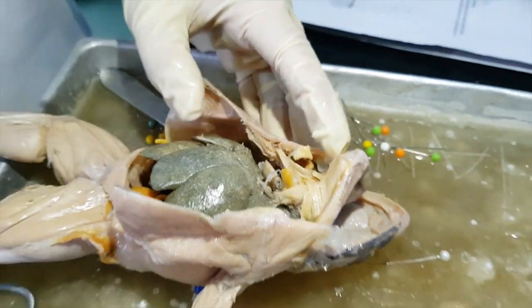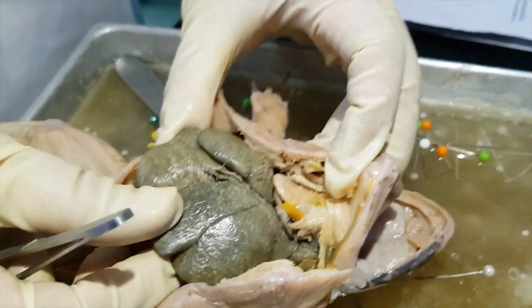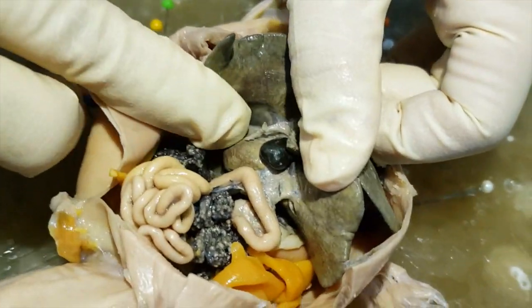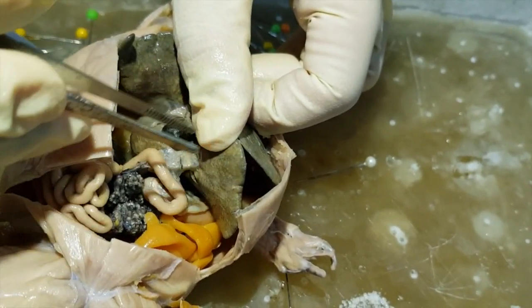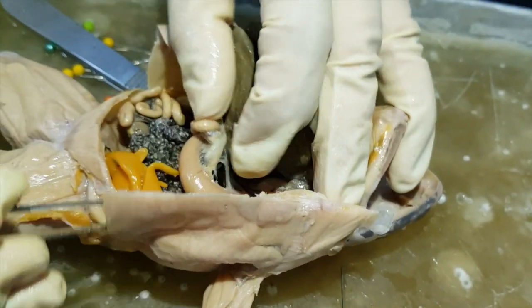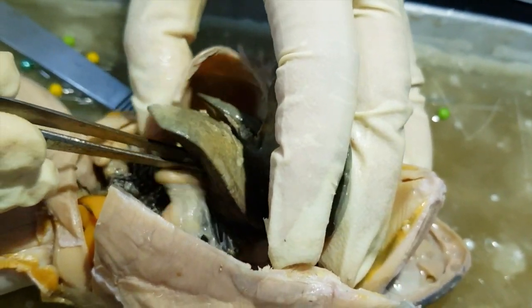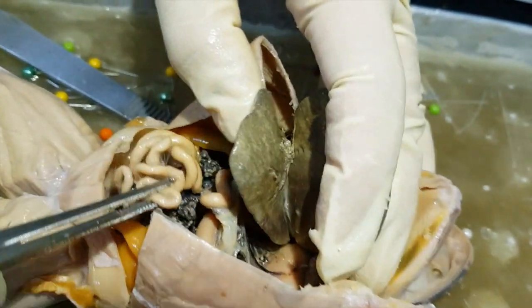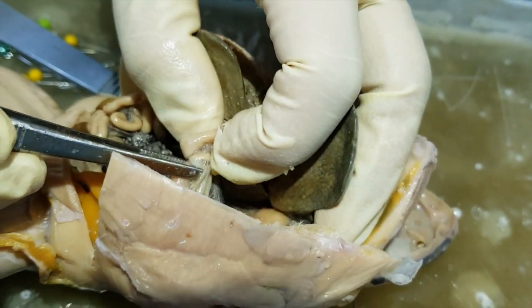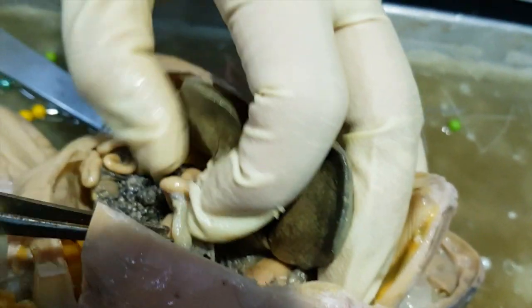Let's start with the digestive system. This big structure here, lobular, is the liver. This one here is the gallbladder. So the gallbladder, the liver, this is the stomach. Then it tapers towards the end to the coiled small intestine. That part of the stomach that goes towards the small intestine is the duodenum. Then it goes to the small intestine.